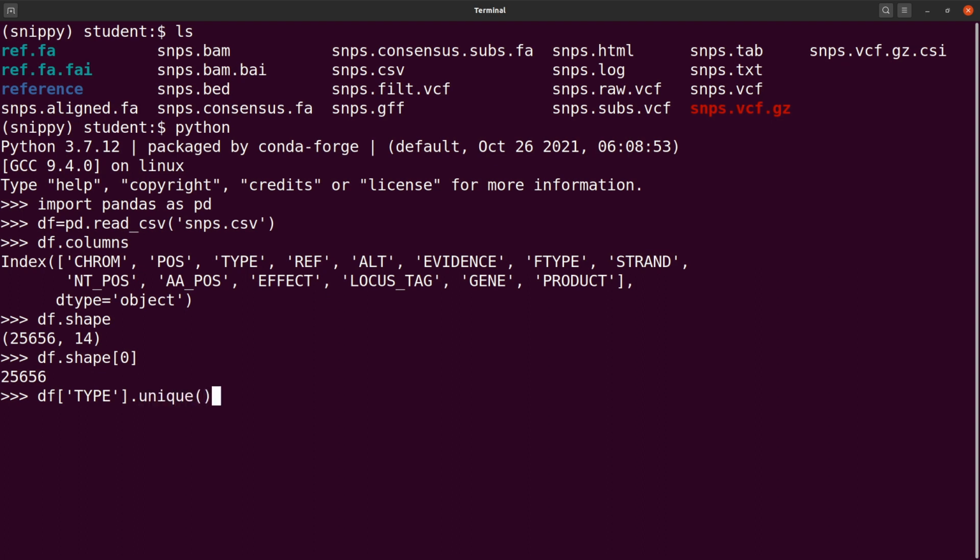Yeah, this one here should do. What this does is it will get the information here, the info here, and then remove duplicates. So that's what it does. Let's run this, and you will see that we have them here. We have 5 of them. Okay, so this is what it does.